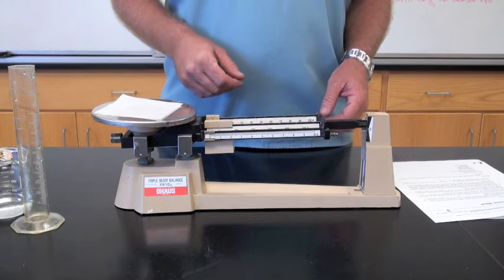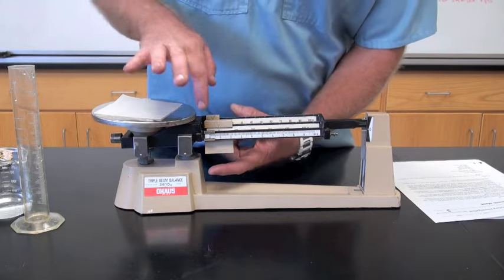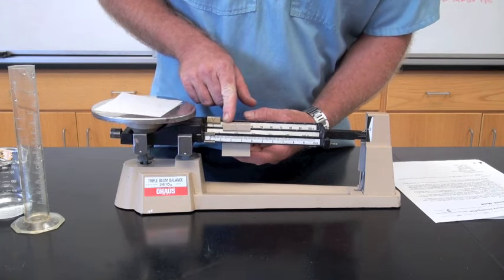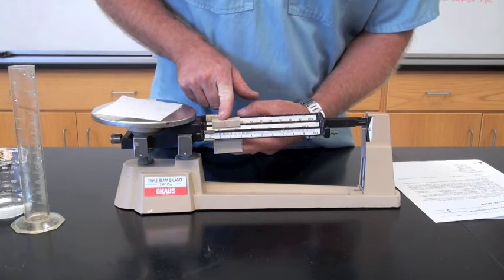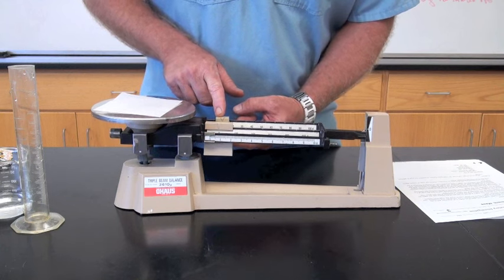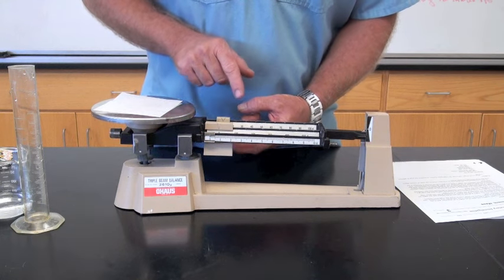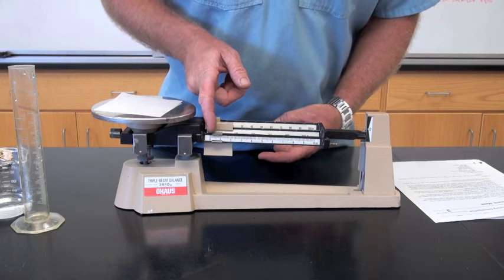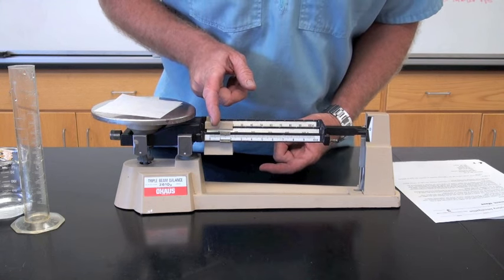I'm going to add this amount to the desired amount of the chemical. So first I have to find the mass of my weighing paper, starting in the middle with my 100 gram rider. Gone too far, now I go back. Use the 10 gram. That's also too far, so now I go back and use the tenth of a gram rider on the front to find the mass of my paper.